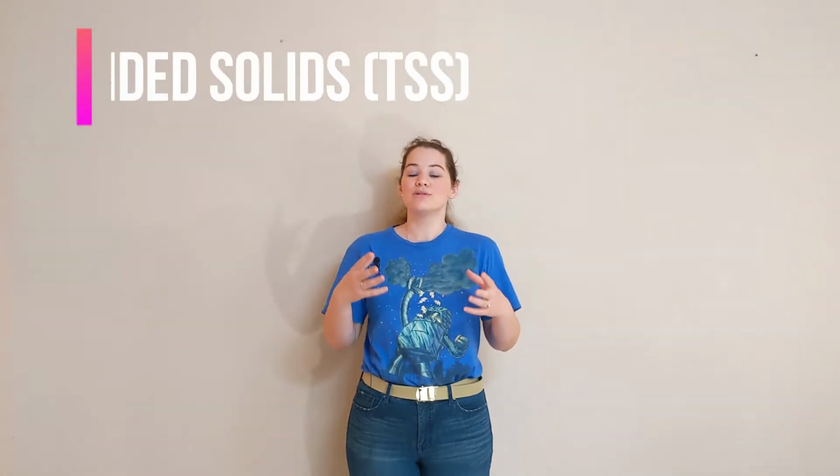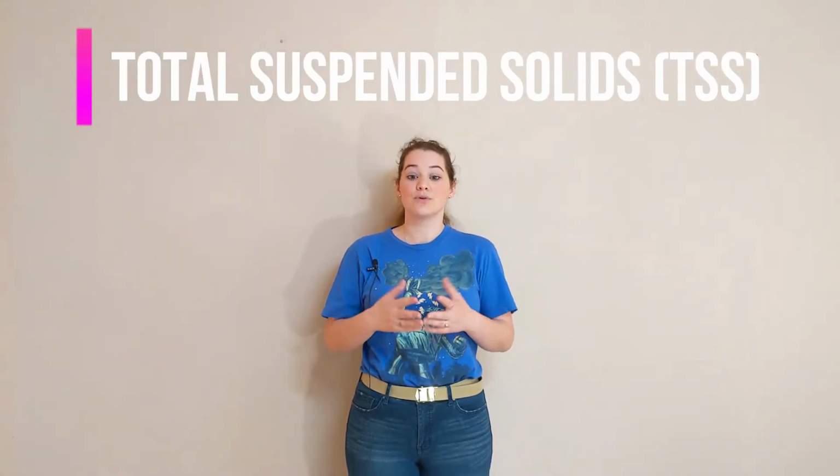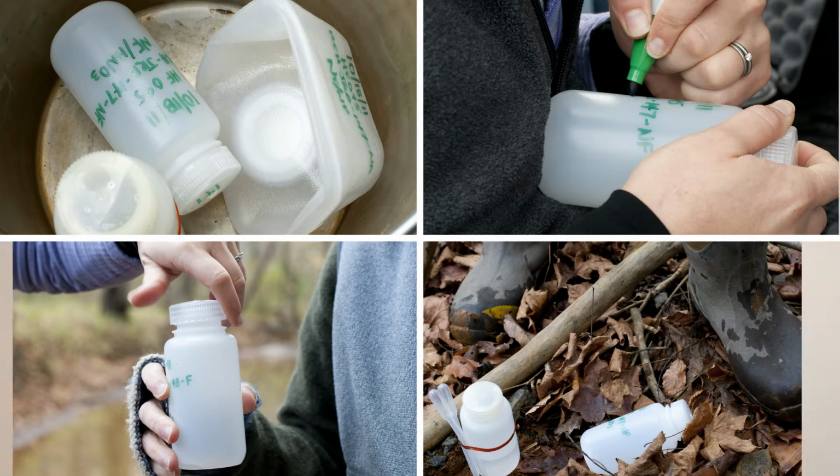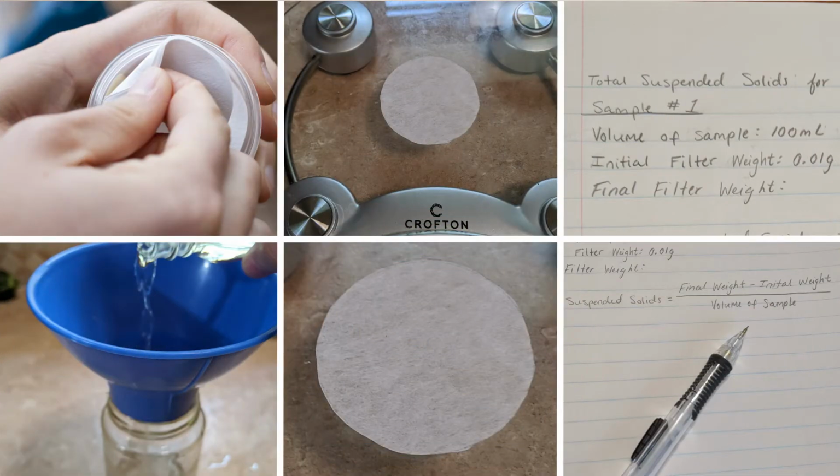A second way that we measure sediments is through total suspended solids. For this test, we collect samples of water in clean jars. We then take these samples into the lab for testing. The testing is simple. We first weigh a very fine filter and record its weight. Then, we pour a known amount of our sample water through the filter and let it dry completely.